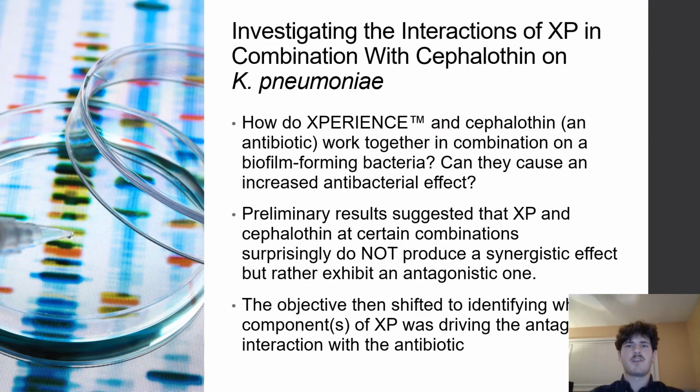The objective of the study was to investigate the interactions of XPERIENCE in combination with cephalothin on Klebsiella pneumoniae. We wanted to know if XPERIENCE and cephalothin work together in combination on a biofilm-forming bacteria, and can they cause an increased antibacterial effect. However, the preliminary results suggested that XPERIENCE and cephalothin at certain combinations surprisingly did not produce a synergistic effect, but rather an antagonistic one. The objective then shifted to identifying which components of XPERIENCE were driving these antagonistic interactions.